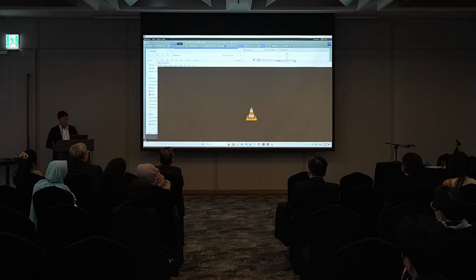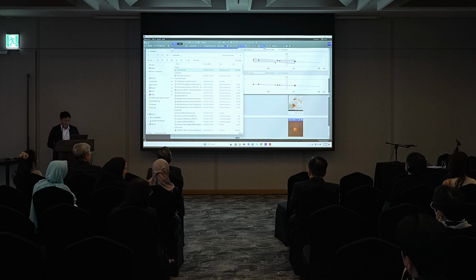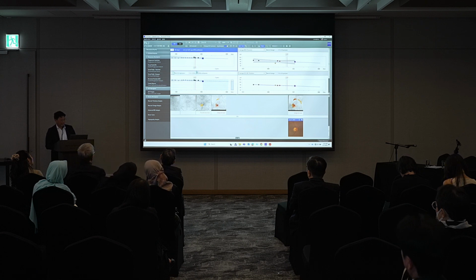So that's that patient. That was just out of interest to break things up, because I didn't know how entertaining GPA analysis would be. But basically, we've got our document display. I think some other things that are useful to know, and I think Manchima had this in her talk as well, but one of the other powerful things that I like to do is actually create a report.